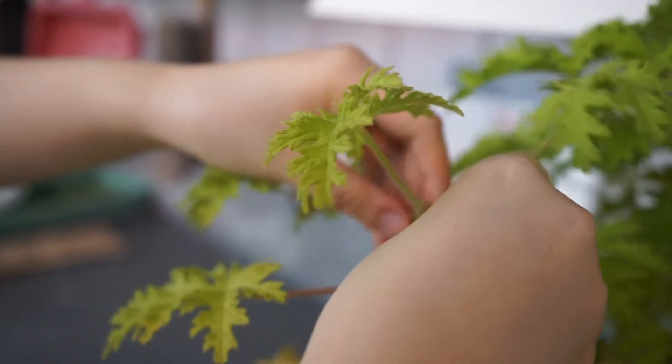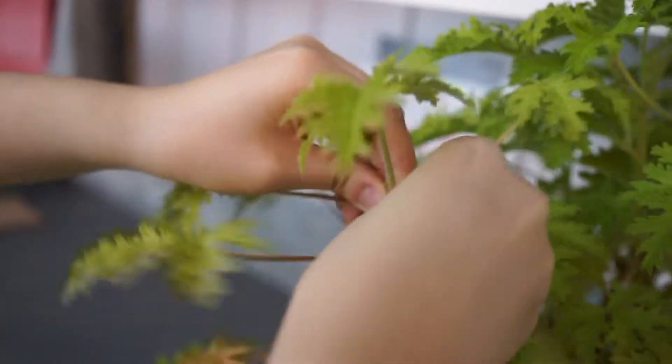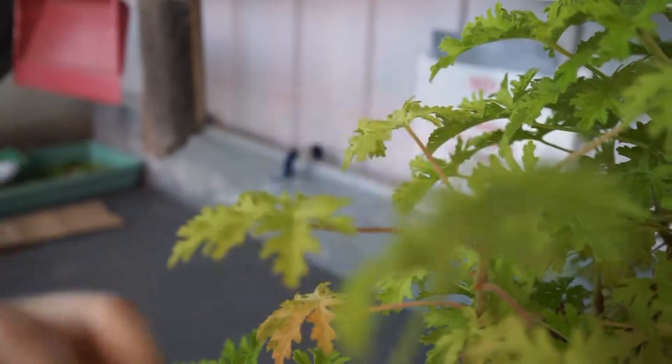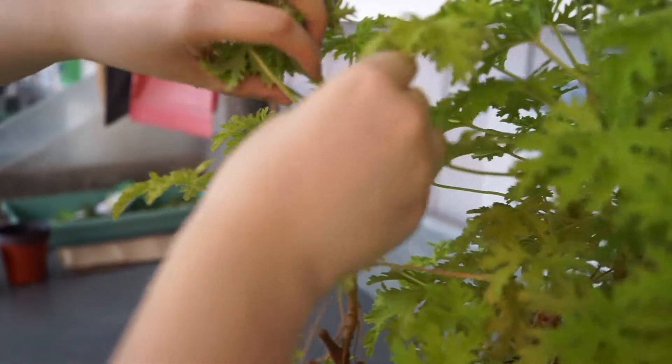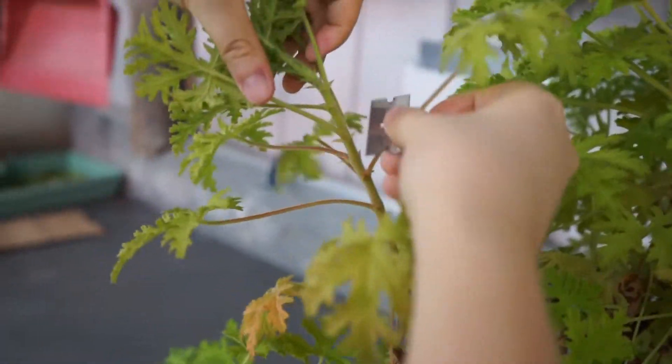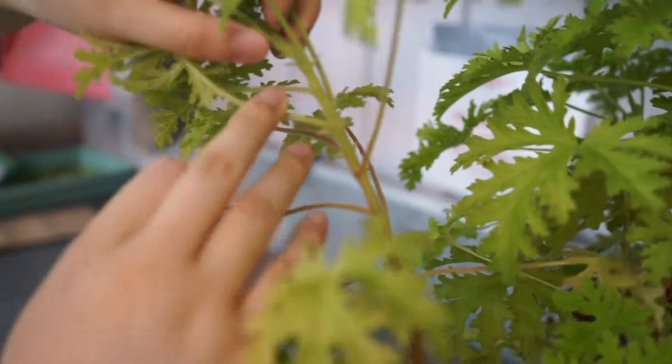Spread the rooting hormone on paper to prepare it for the comparison group. Carefully cut a portion of Pelargonium stem from the top with a blade. For 4-node cuttings, count the number of nodes before cutting, but exclude the apex, which is not part of the cutting.